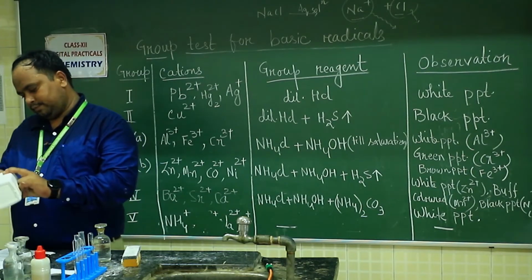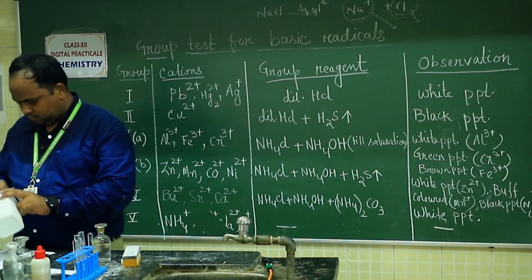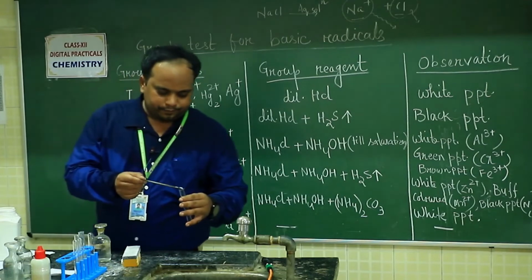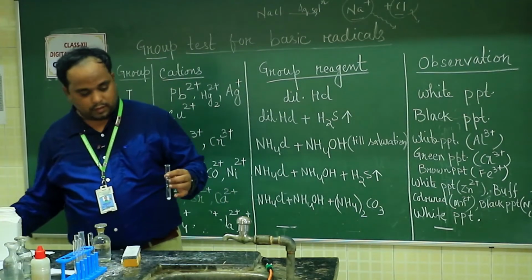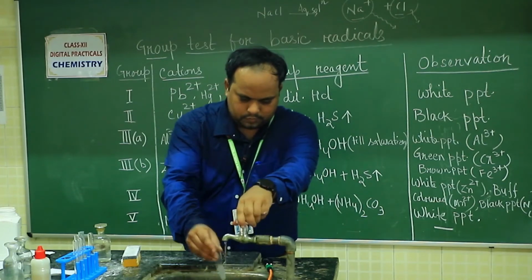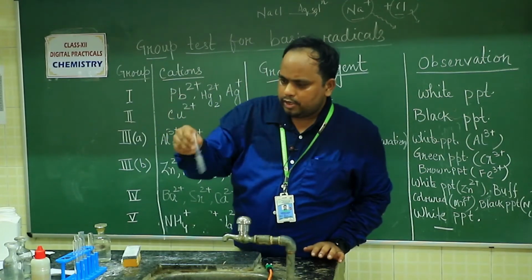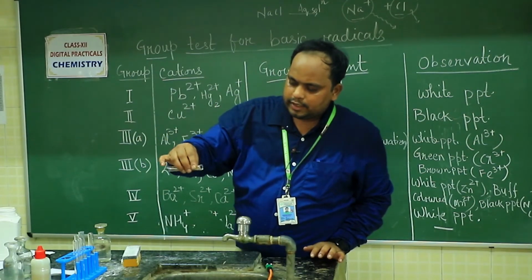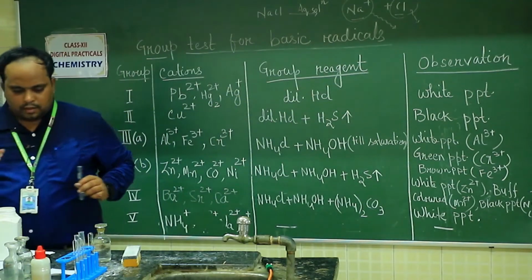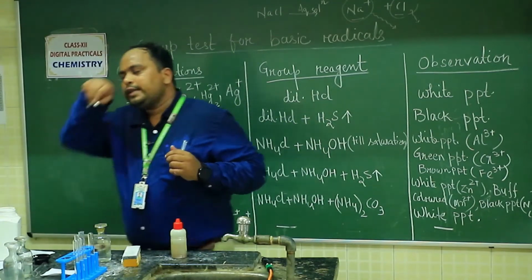So see, I am taking a pinch of salt, I am adding some water, 2 to 3 ml water you add, you will get a solution. To this you will add one reagent I am taking, that is called Nessler reagent.